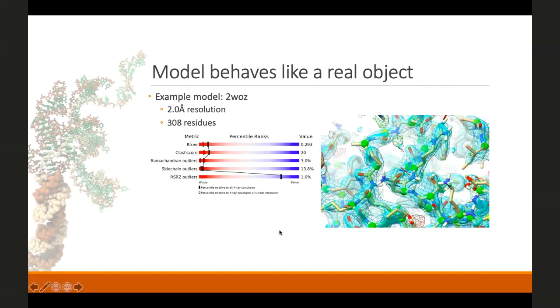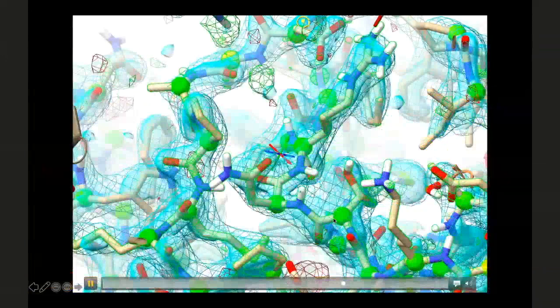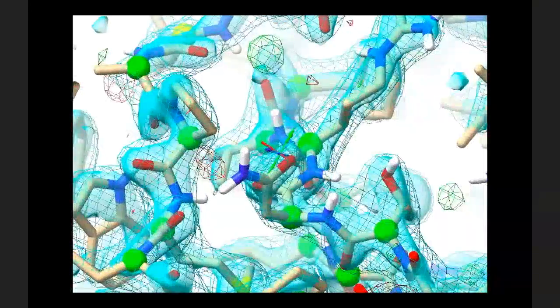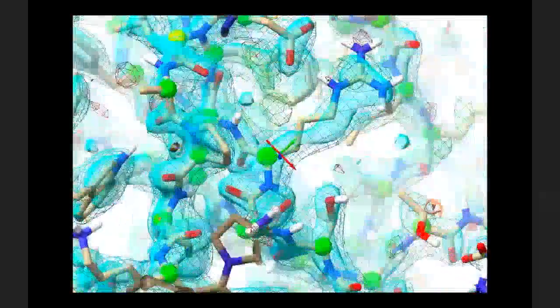You can restrain the distance between any two non-hydrogen atoms. This first video is designed to illustrate why molecular dynamics is the right tool for this sort of work — the model behaves like a real physical object. Here we have the model jiggling in its map. I'll reduce the temperature down to zero Kelvin so atoms only move when I interact with them. With traditional restraints, dragging atoms would cause them to simply fall into whatever density you drag them into. But here the atoms push back and everything falls back into place.